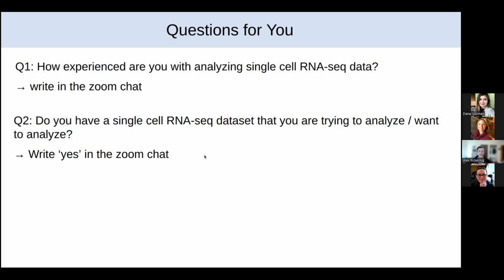This could be a publicly available data set, or a data set produced in your own lab or in the lab of a collaborator. If that's you, let us know down in the Zoom chat. I'll follow up with you directly after the workshop to make sure that if you need any support for Cellenics, you're getting it.